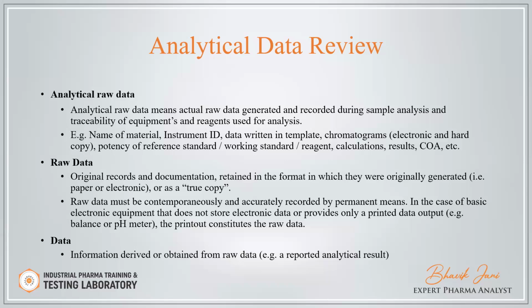What is the data information derived or obtained from the raw data? It's called the data.